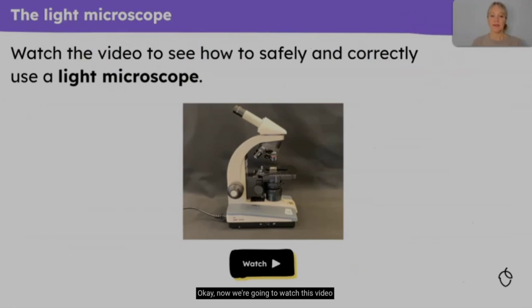Okay, now we're going to watch this video to see how to safely and correctly use the light microscope.